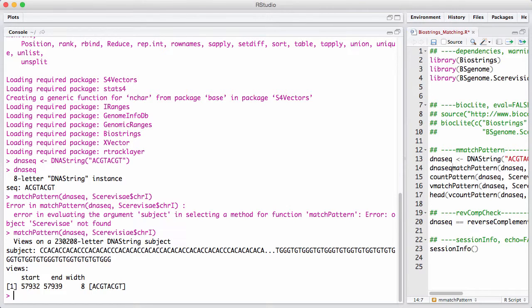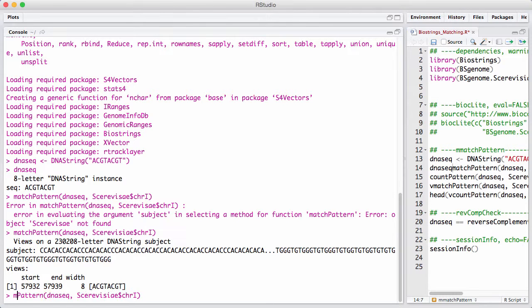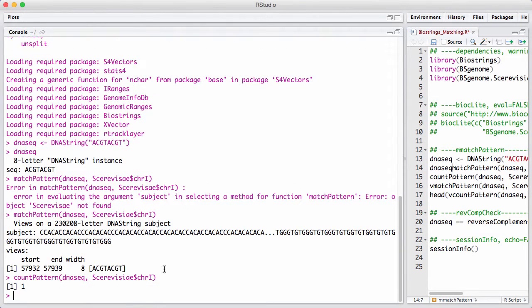Whenever we have a match function, there's also a count function that just counts how many matches we have. Most of the time, you're not interested in matching against a single chromosome. You're really interested in matching against a set of chromosomes.